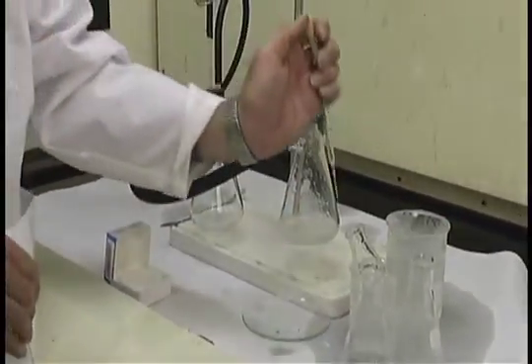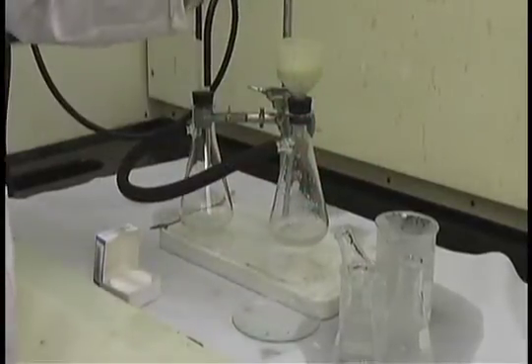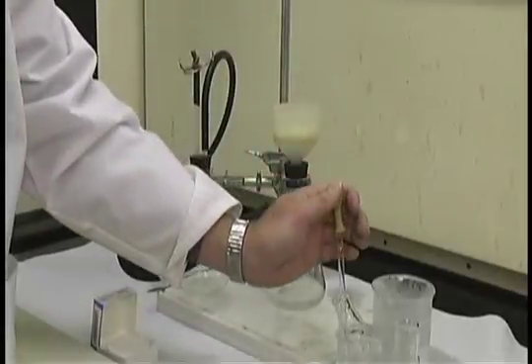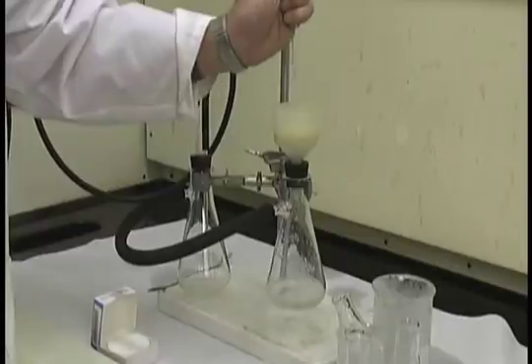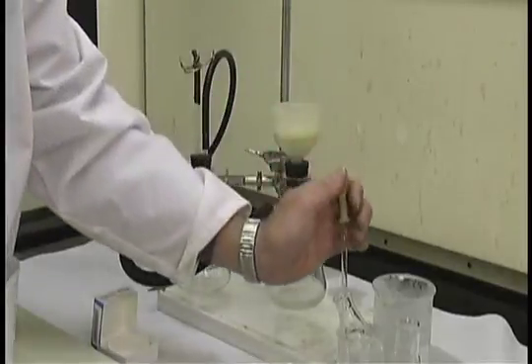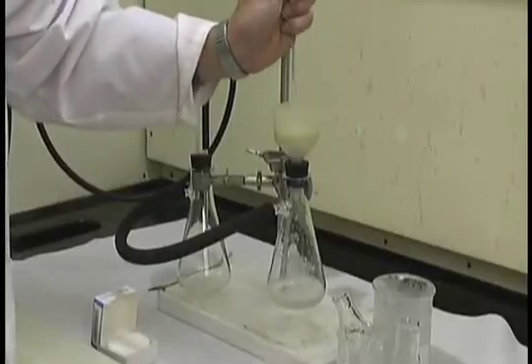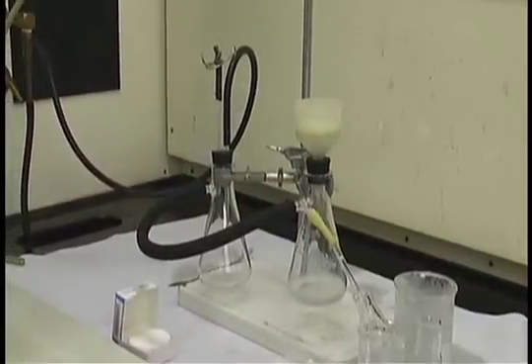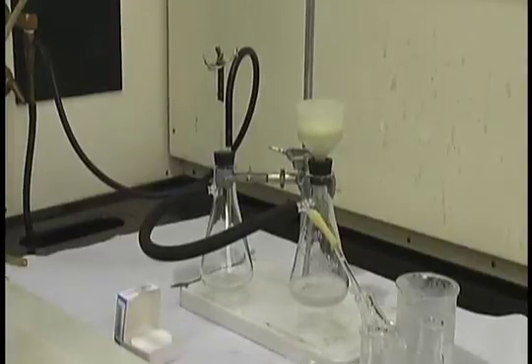Rinse the collected solid with fresh recrystallization solvent that has been cooled in an ice bath to remove any traces of impurities that may be adhering to the surface of the crystals. Typically, you only need three or four pipette-fulls, or a total of five milliliters of the ice-cooled solvent. You can then allow the vacuum to pull for a minute or two to remove most of the remaining solvent from the solid.